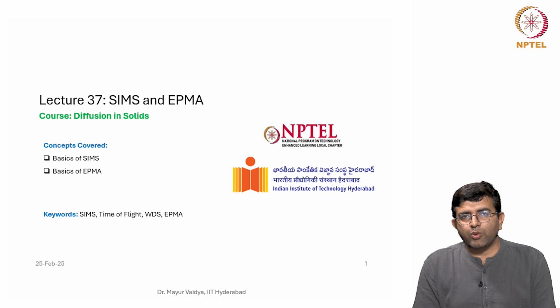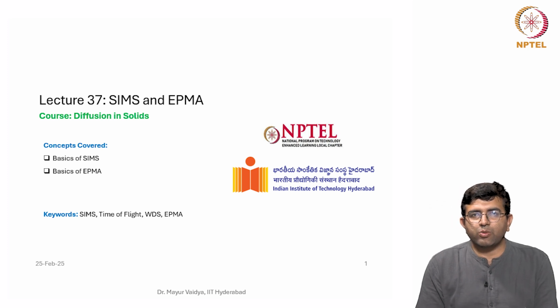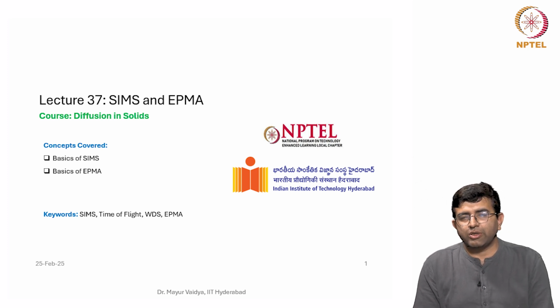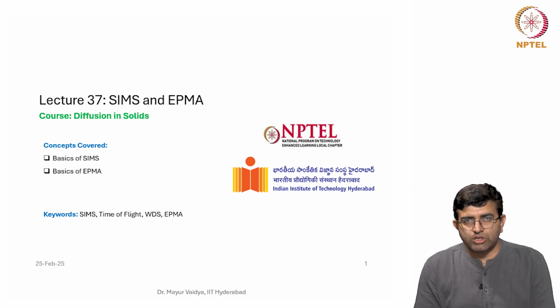Basically, last class we saw a very important technique, radiotracer diffusion, utilized to measure the diffusion coefficients, and we saw the ranges, advantages, limitations, what it can do, and what the drawback is. So today we are going to see two more direct methods of measuring the diffusion coefficients.